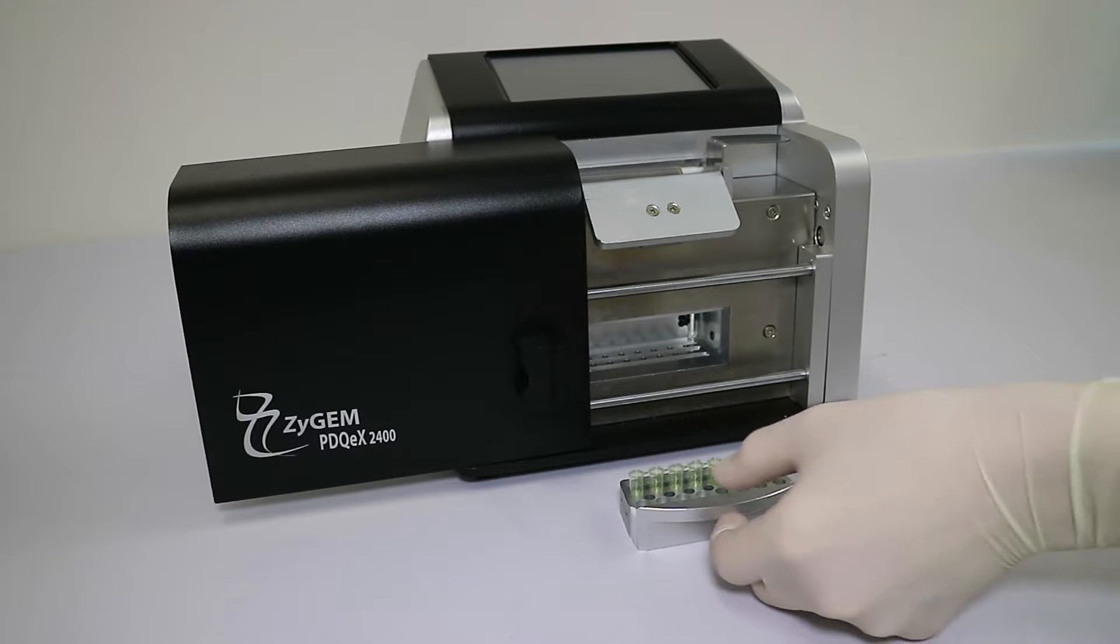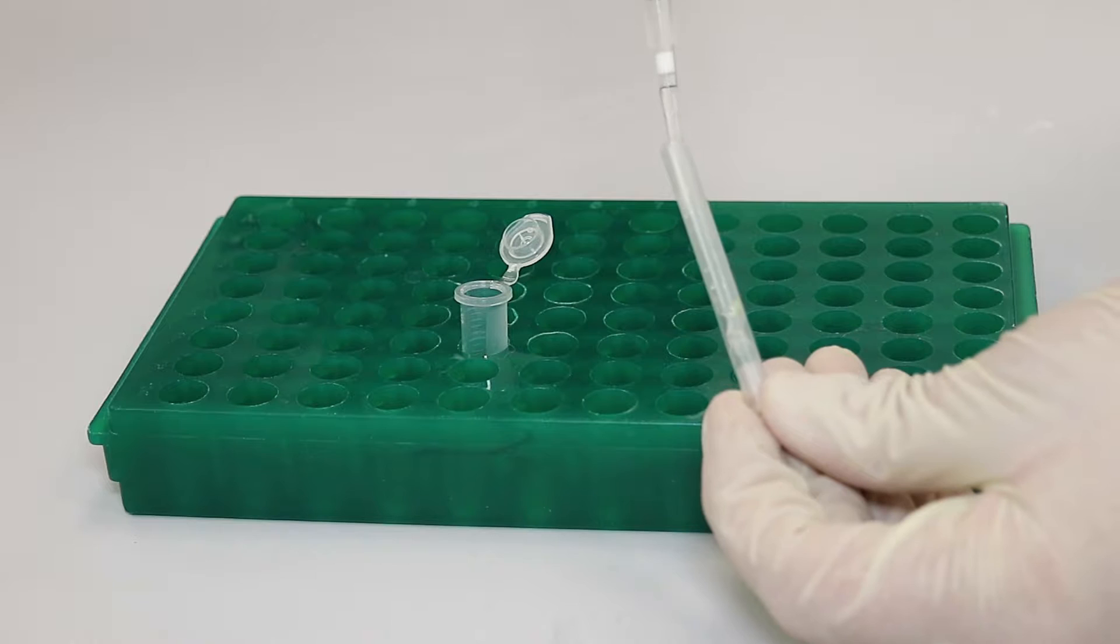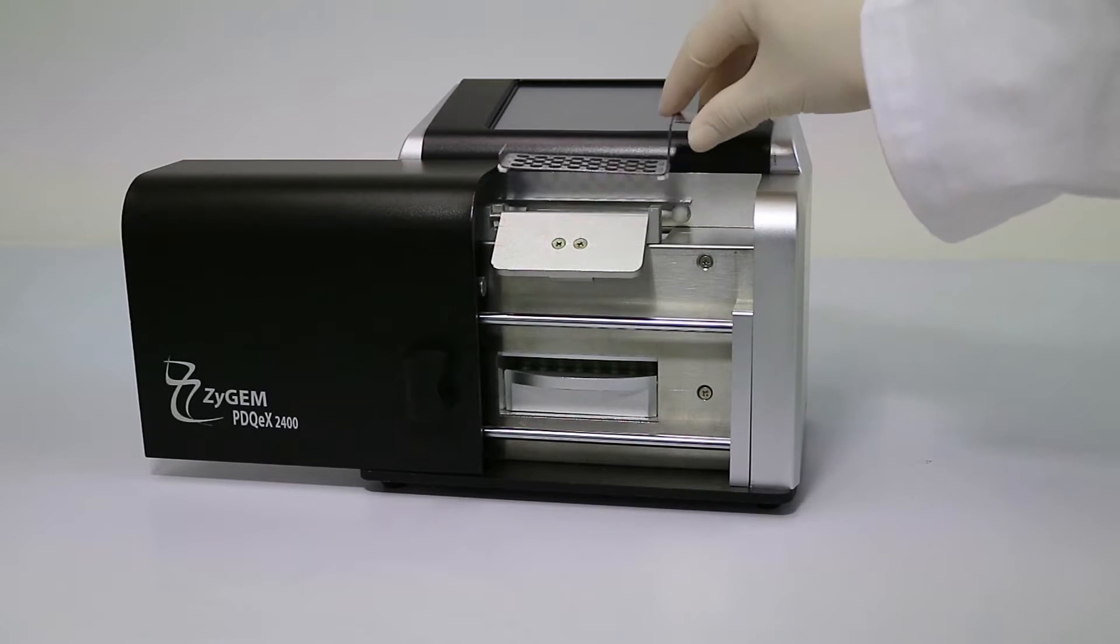Collection tubes or a 24-well tray are placed into the collection drawer. Reagents are added to the tubes. Then the PDQX tubes are loaded into the heat block of the instrument.